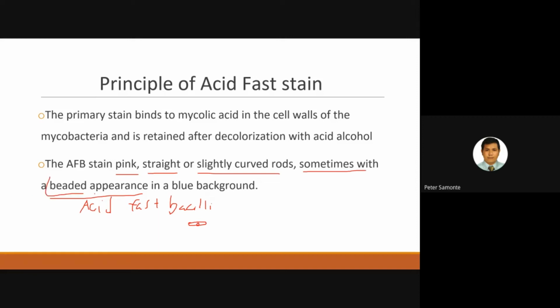Class, question. Itong beaded appearance na to, if you recall sa mga components ng bacteria na diniscuss natin before, which part of the bacteria is that that gives the beaded appearance? We're talking about here Mycobacteria, class. Any ideas? What part of your Mycobacteria would give the beaded appearance?